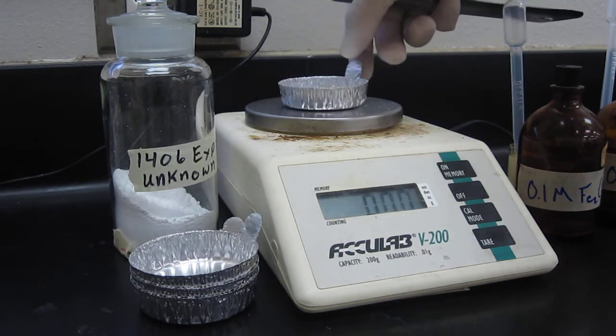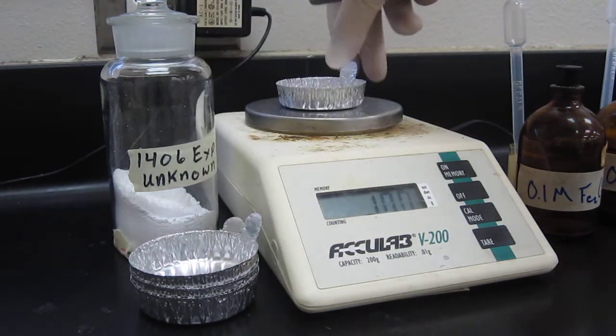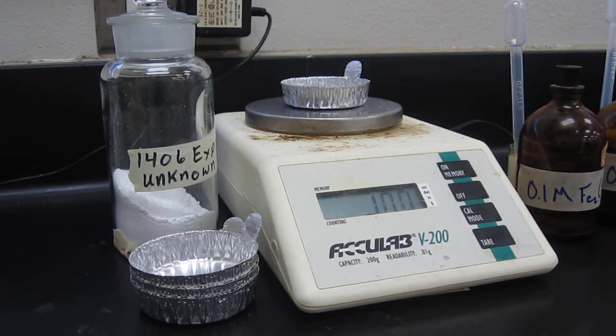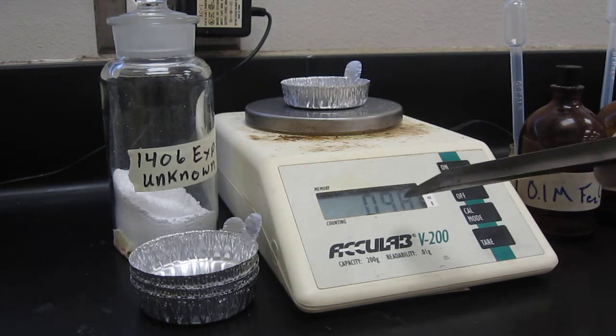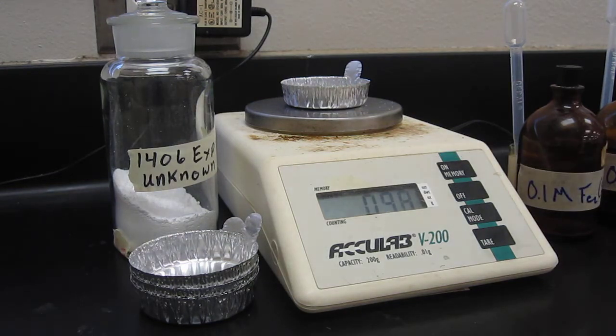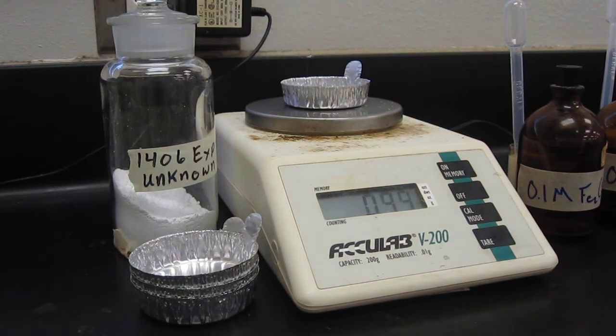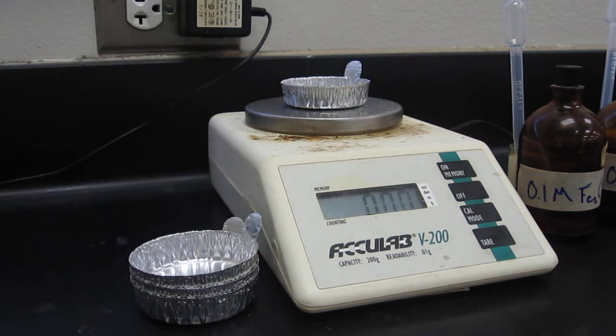Then we're going to put our weigh boat on there — this is what a weigh boat looks like. Notice it tells us the mass of the weigh boat, about 0.98 grams there, so we're going to push this button here, it says tare, and that's going to tell the balance to not worry about how much that weighs.